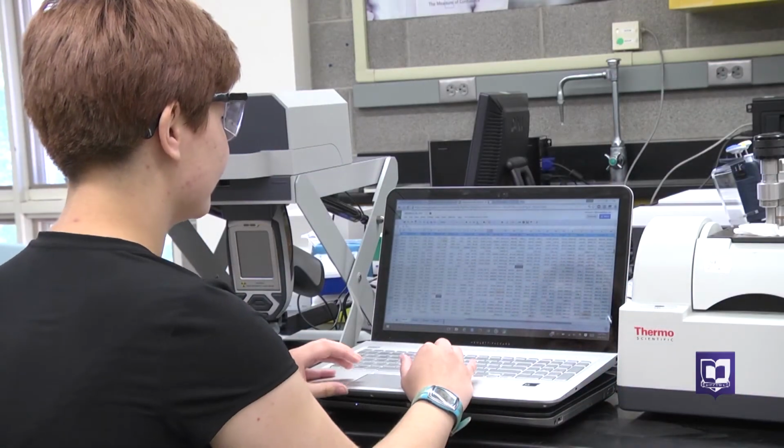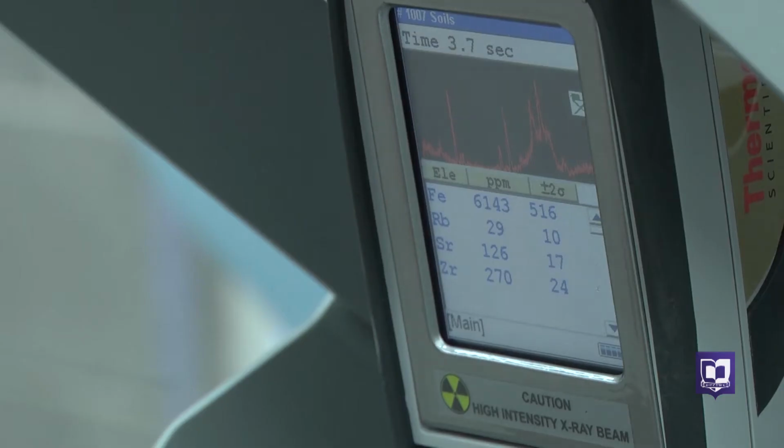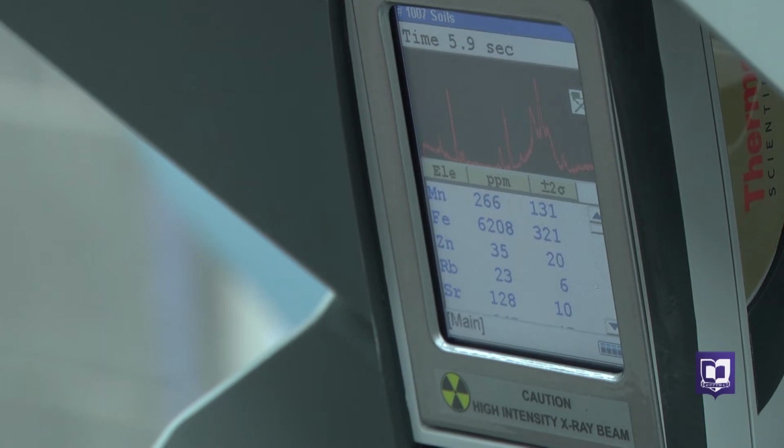Davidson says she wants to help find more ways to use the XRF for data collection, and she's hopeful she can do that working with Professor Strong. I really like being able to work with Cindy, especially one-on-one, so that we basically have time to discuss with each other what conclusions we can draw from our research, what the next steps are. We can go through and analyze every little problem together to make sure that all of our methods are working.